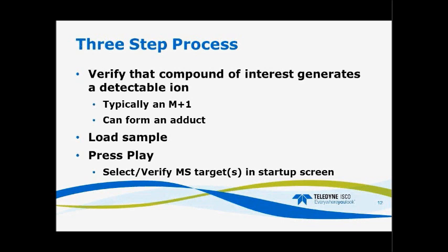Second step in the process is to simply load the sample. Third step is to press play, and you can select or verify your MS target or targets in your startup screen. It's not necessary to go over into Method Editor and build a method to include all your values. You can simply do it in these three steps.